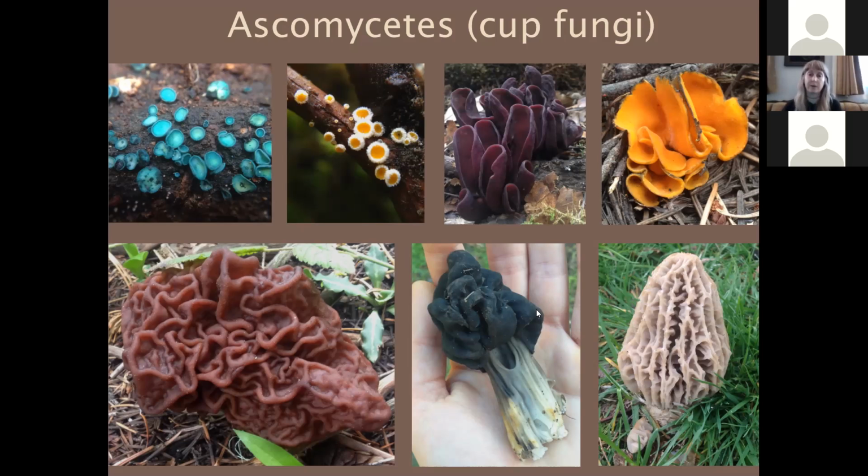And just a note on when you're measuring spores, it's very important when you're measuring them to get mature spores. So if at all possible, you should try and do a spore print onto a glass slide and then scrape a little bit of those spores up from the glass slide and put it onto your sample, so that you're making sure you're only measuring mature spores and not immature spores, which might be smaller.